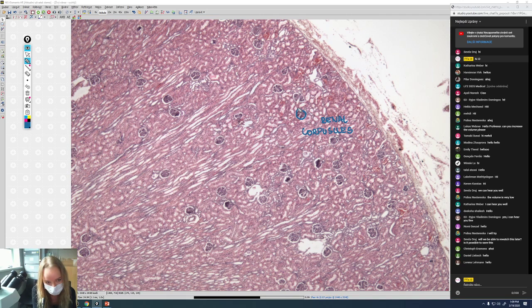So these are the renal bodies, small renal bodies. We're going to describe them later. They have some parts, but these bodies are typical for the cortex. So when you find something like this, little circles around here, you can say, okay, this is the cortex. So the whole cortex is somehow like this.